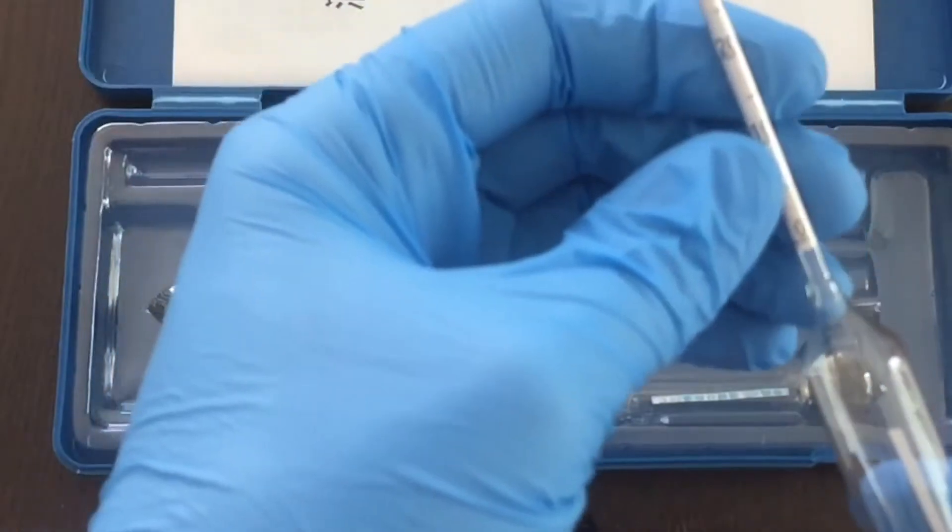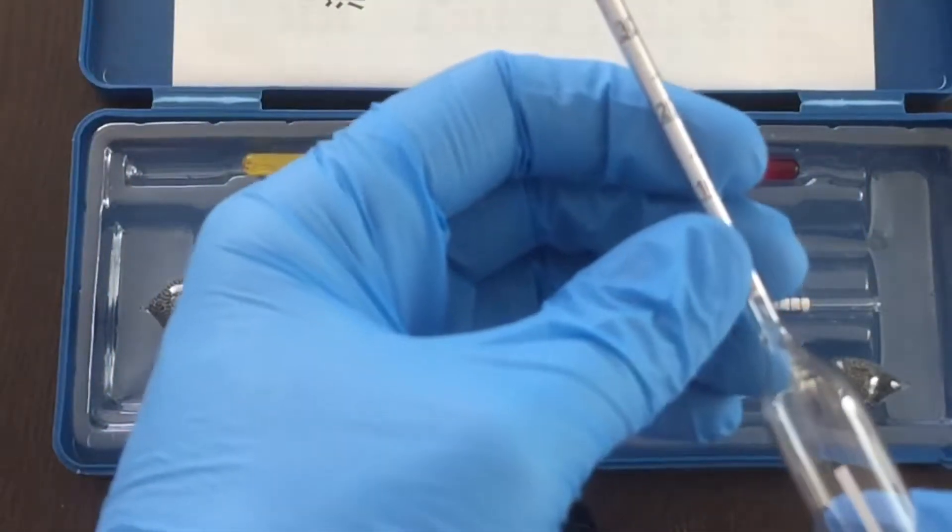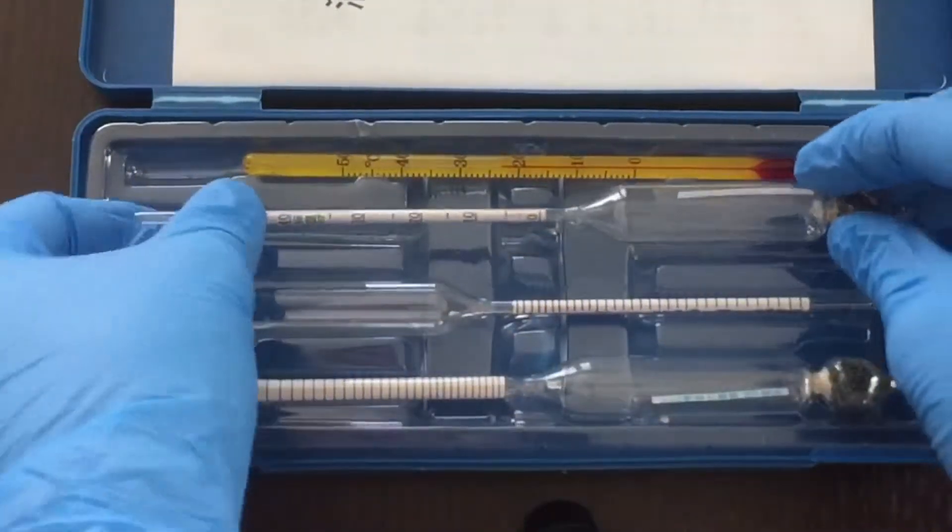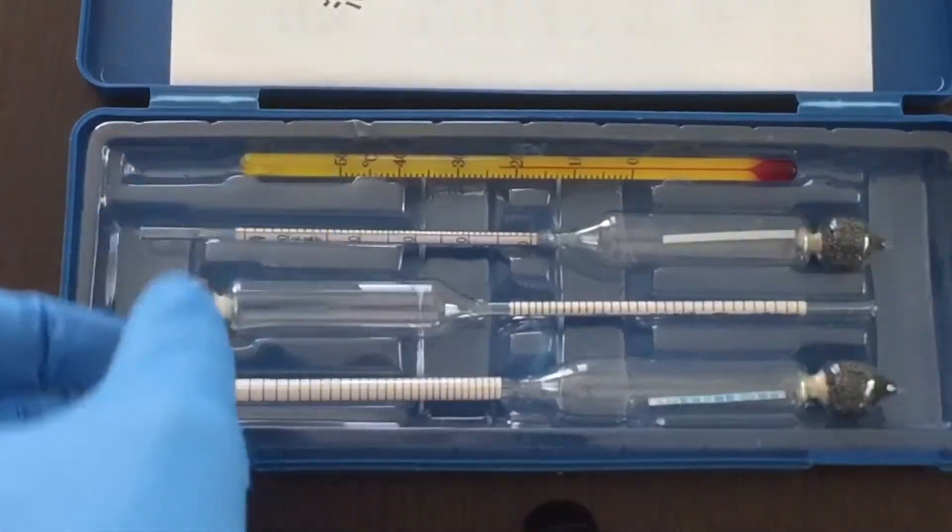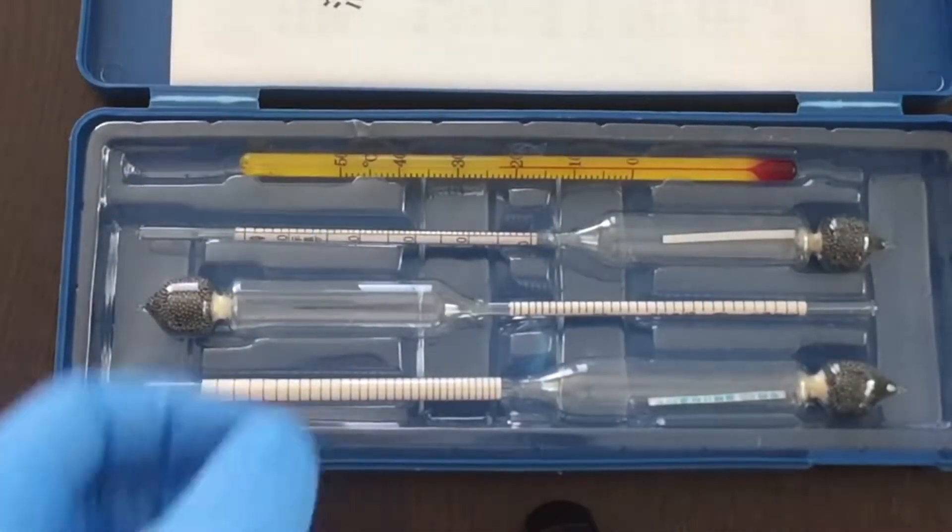As you can see in the video I'm showing you the different concentrations. This one is rated 0 to 40 and then there's another that's 40 to 70 and the last one is 70 to 100%.